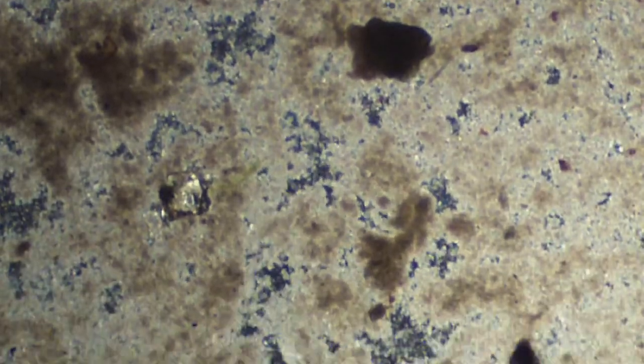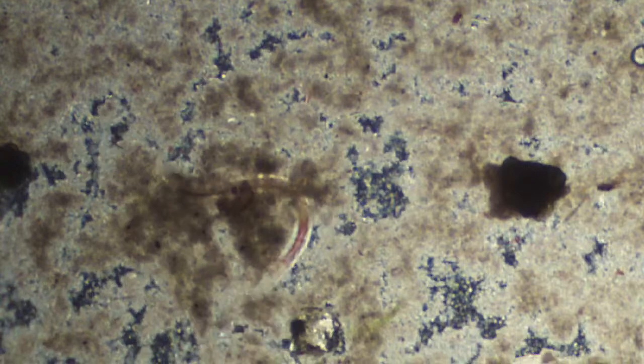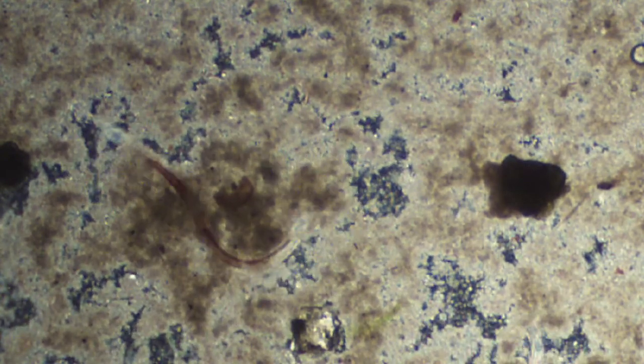Ooh, nice. There's a nematode that's eating some other stuff that's very red. Look at that. Very colorful.